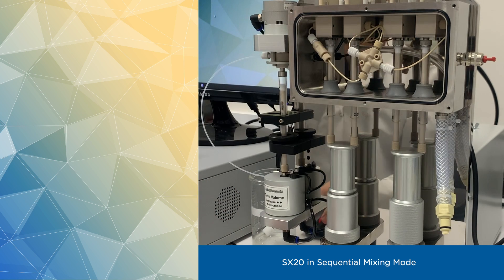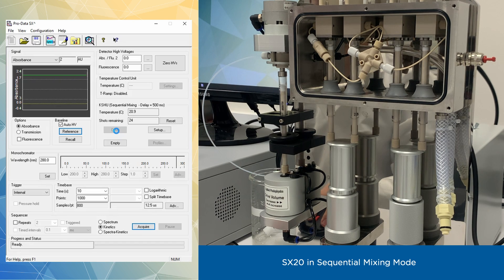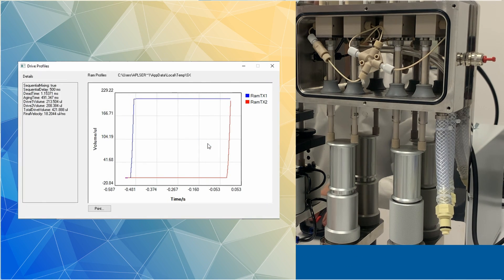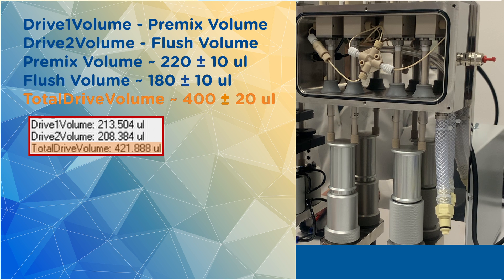If your profile information is visible, let's proceed. In our previous video, where we calibrated drive volume for single mixing setup, a drive 2 volume showed about 120 microliters, as we would expect. Now we're seeing drive 1 and drive 2 volume. The first volume value is premix volume, which should be around 220 microliters, while drive 2 volume should be around 180 microliters, to make up a total of 400 microliters.